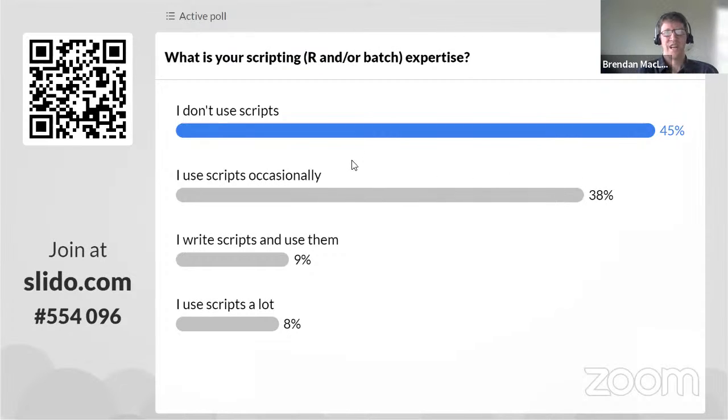Up until last year, I would typically present a script and say, this is a great way to run Skyline. I wrote this script. All you need to do is edit it. And then I realized that a lot of the people that I was working with were not even ready to edit a script.